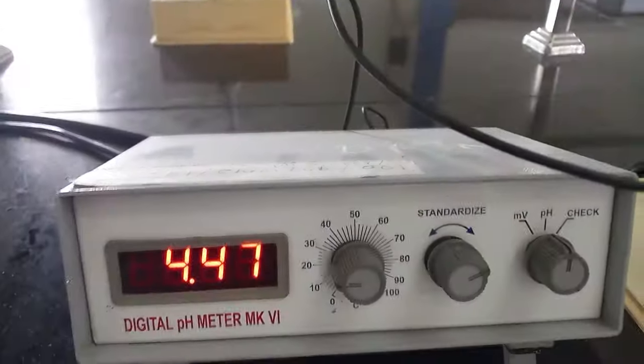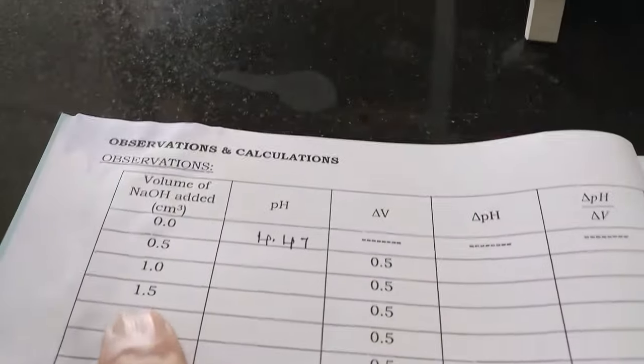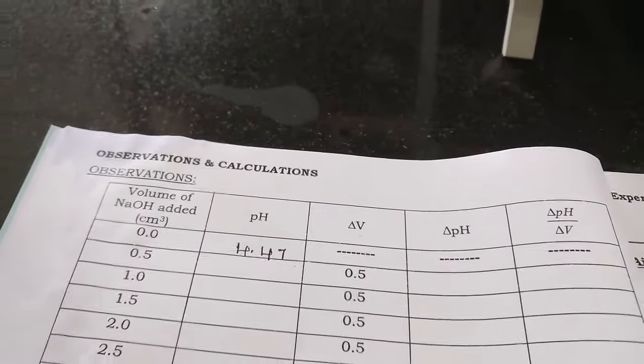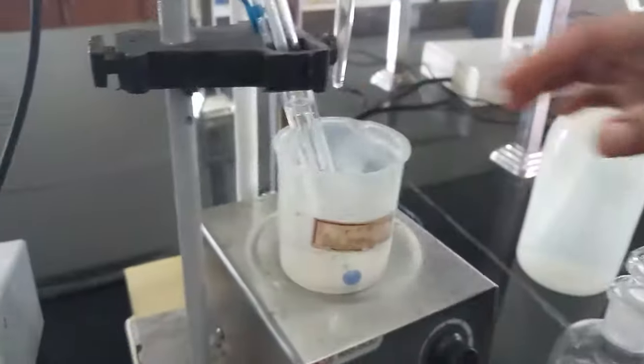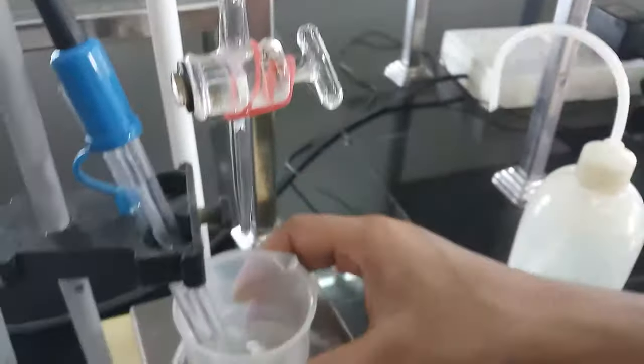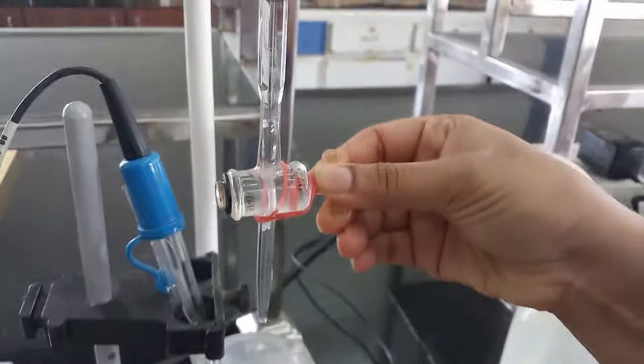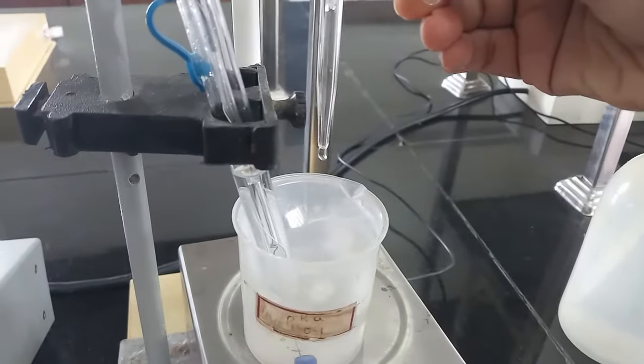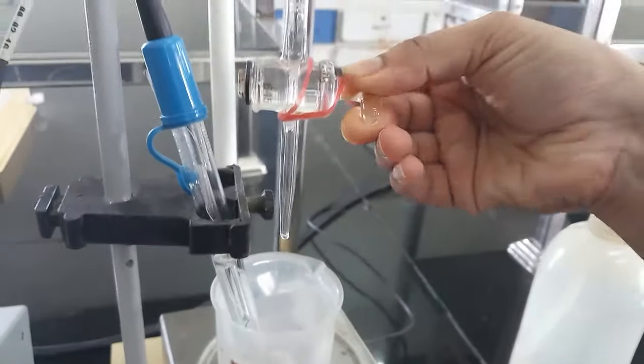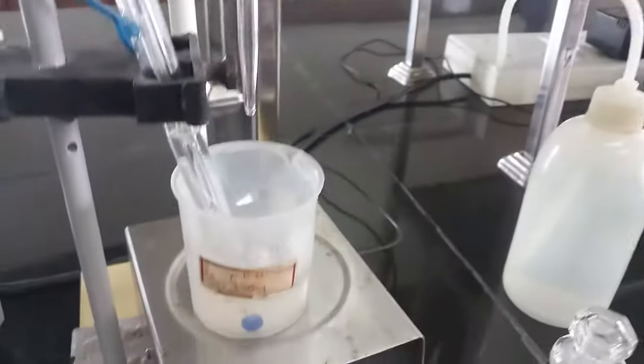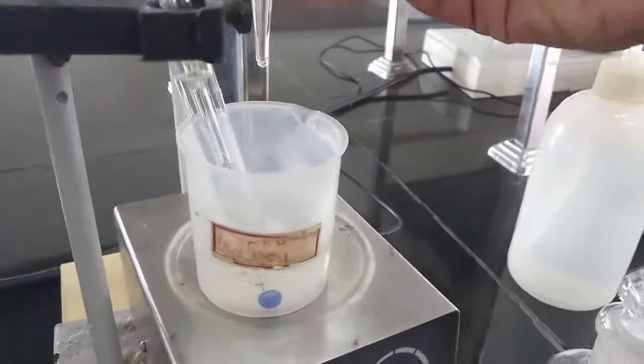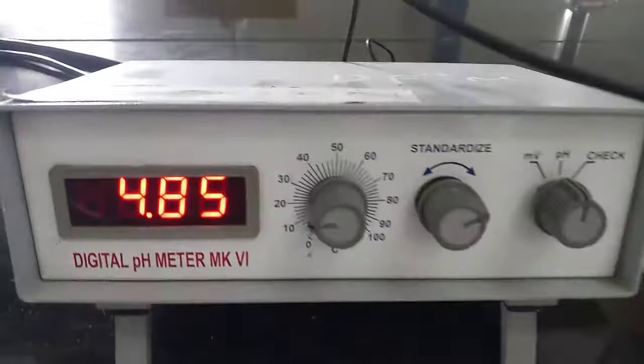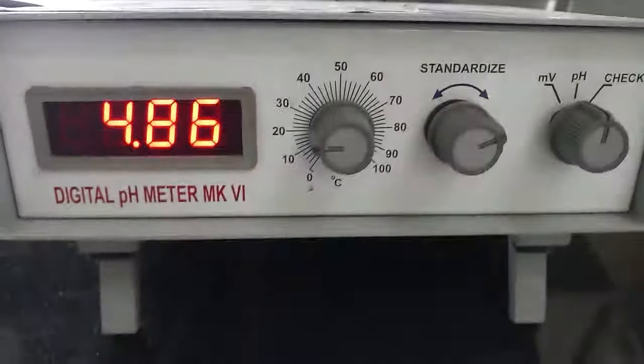Now first value is recorded 4.47 here. We have to add NaOH in 0.5 ml increments continuously, and the magnetic stirrer continuously stirs the solution. Continuously 0.5 ml successive addition of NaOH, and as a result the pH changes.